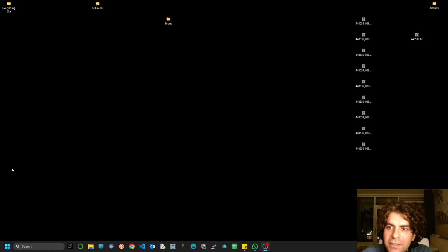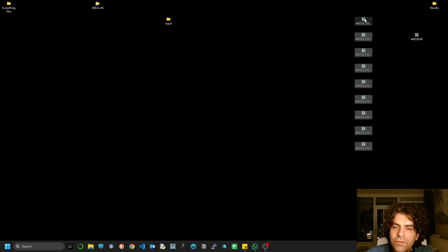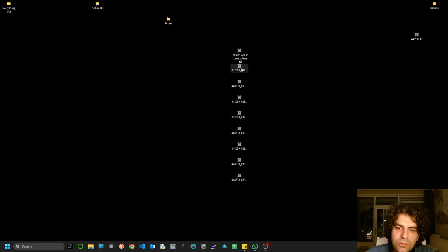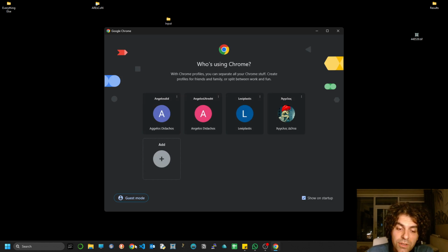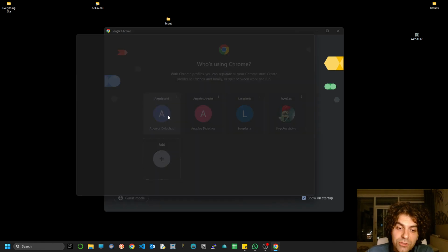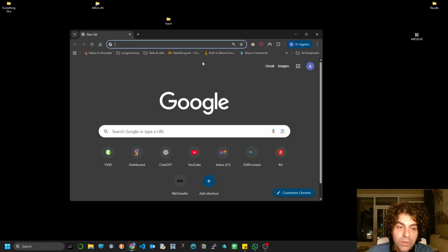Alright, we're back, and I've saved all the files from the multistack into single images from 1 to 9. The next step is to get inferences from an already trained model with CellPose. I'm not going to show you in this video how to train a CellPose network, but I'm planning to do that in a different one. For now, let's assume that you've already trained the CellPose network, which you can easily learn how to do if you visit the GitHub page of CellPose.